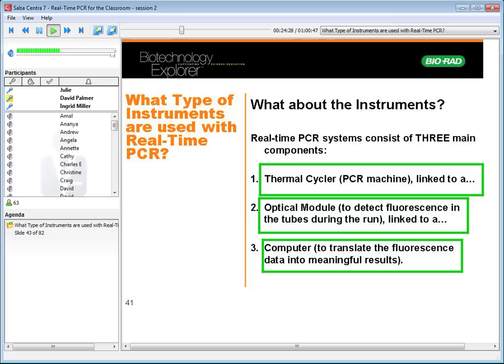So some basic troubleshooting. A good real-time PCR reaction will have nice flat baselines. The replicates for the same sample will be tightly clustered. The lines will almost be on top of each other. Our dilution series will be spaced out evenly because it's all about that left-right curve position that shows the quantity. So if we make a dilution series, it better be spaced out. The curves should all be nicely S-shaped because that's the classic shape.